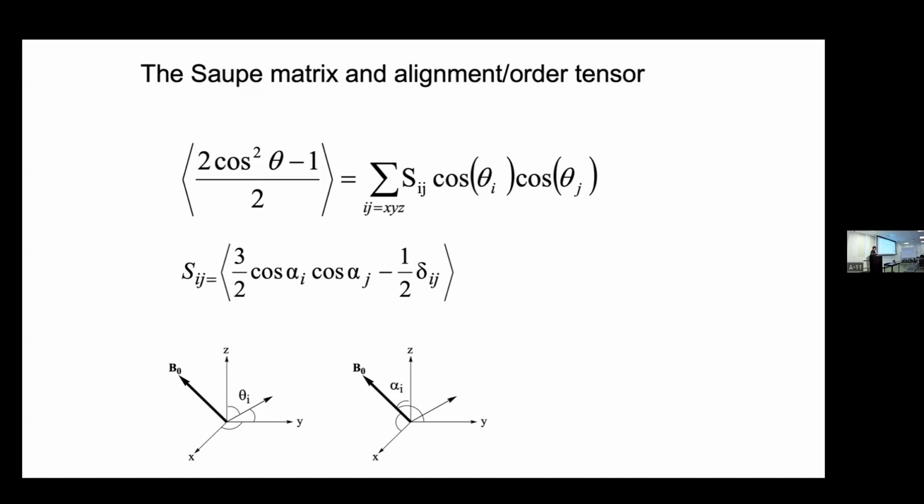And all of us, if we are part of a molecule, we each share a common alignment tensor. Your alignment tensor is my alignment tensor, right? We're the same molecule, right? So therefore, the RDCs can constrain the orientation of bond vectors relative to the common alignment frame. And that's the power of the method, the measurements in terms of determining information about the orientation of bond vectors and their dynamics as well.